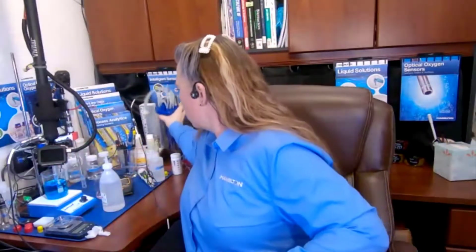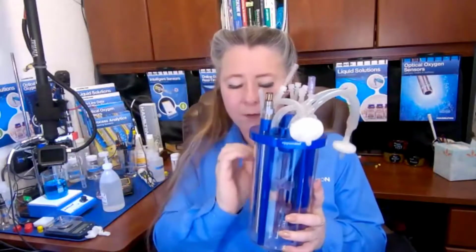But there are some situations in some laboratories where you might be forced to autoclave your sensors dry because your autoclave is not big enough for your sensors to be in your bioreactor with all the sensors in, possibly filled with media, to go into the autoclave.